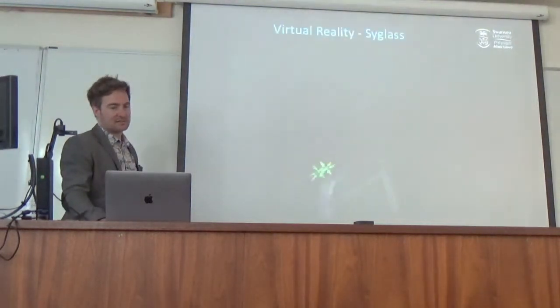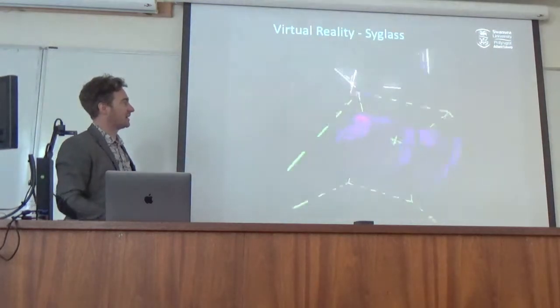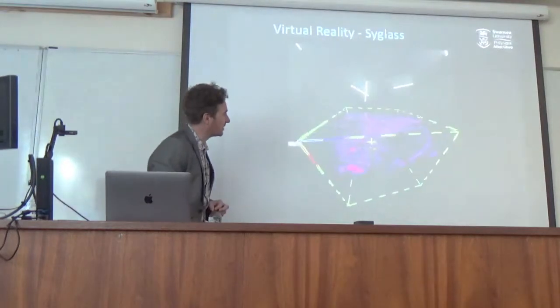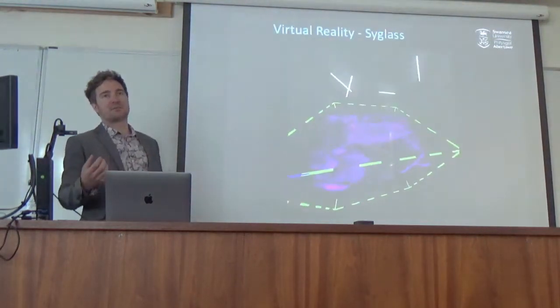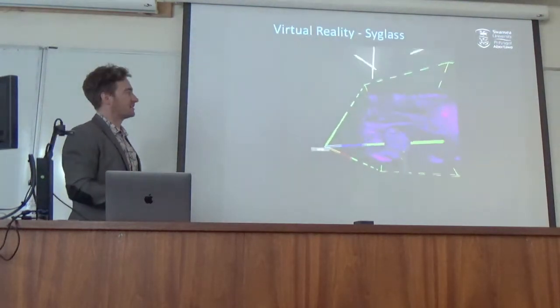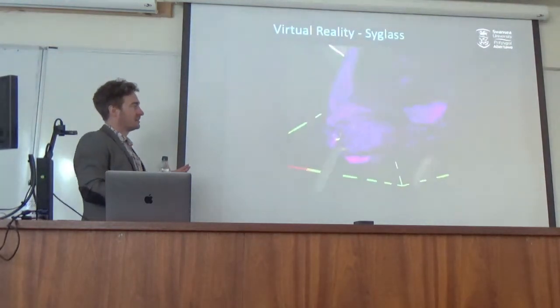So this isn't a glossy video from that VR software. This is actually a headset mirroring recording. It doesn't look that great on the screen. But effectively, just use that fish sample that I mentioned. This is potentially one of the most challenging ones for us to segment because it's got lots of cool architectures and muscle fibers that we want to segment. But now this is looking at it in volumetric and in VR.